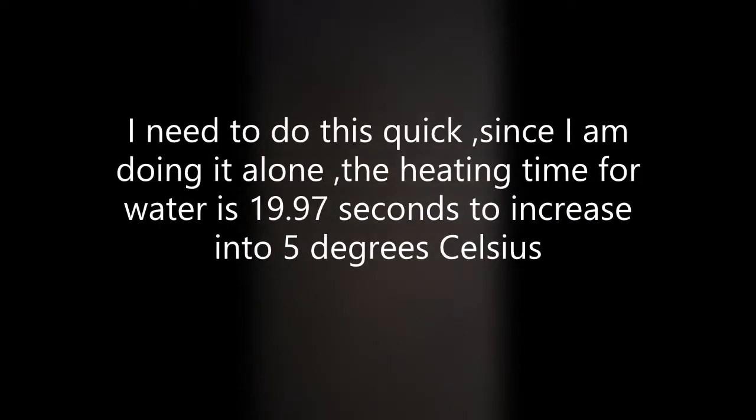It took a long time. 19 seconds. The water was slow to increase. 19.97. Sorry, class. The water to increase by 5 degrees, it's only 19 seconds.